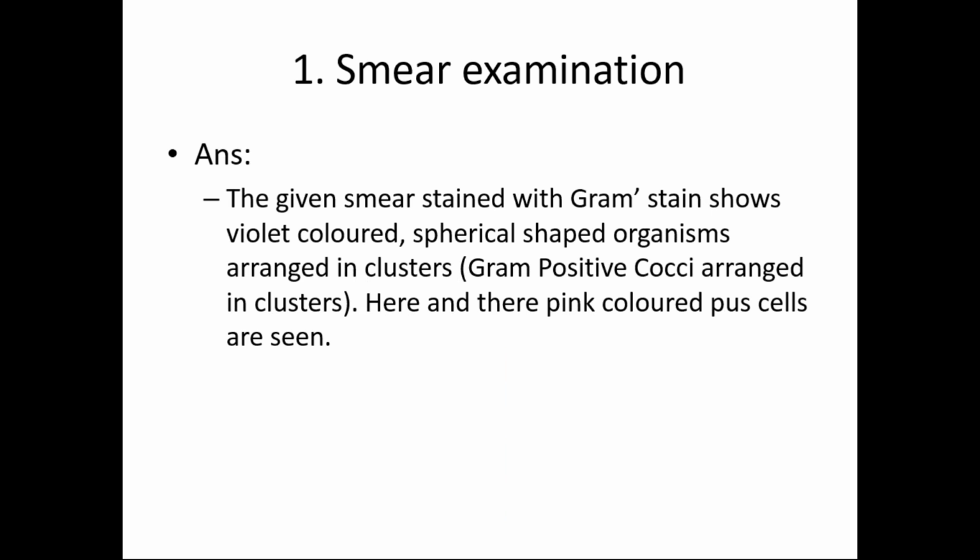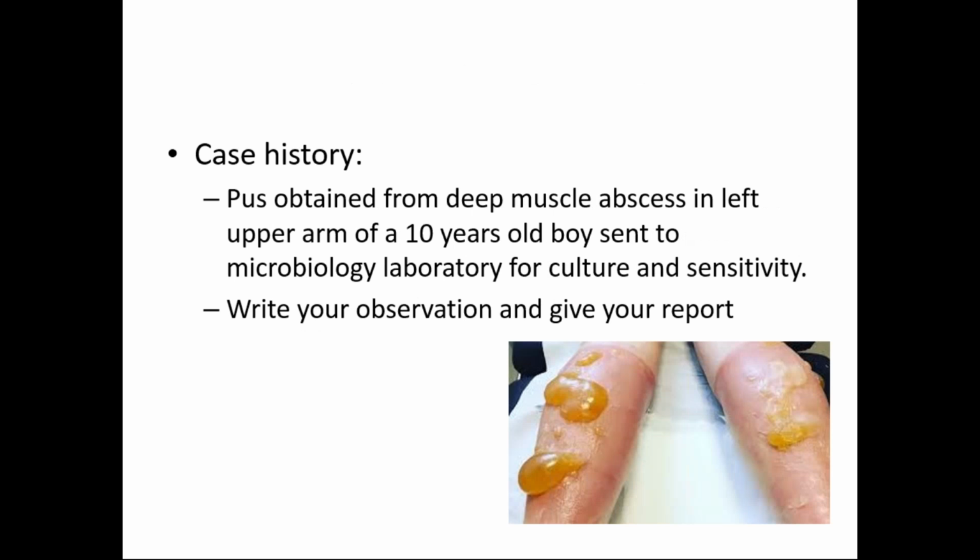First question, smear examination. You perform Gram staining. What is the question given here? Second point, write your observation and give your report. When you obtain pus, you immediately inoculate it into culture media. The next day, you look for growth. If there is growth, you process it.